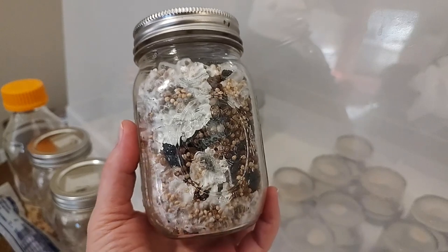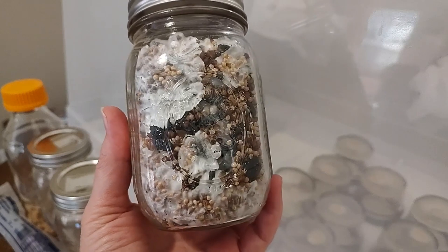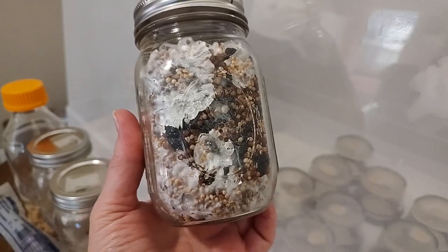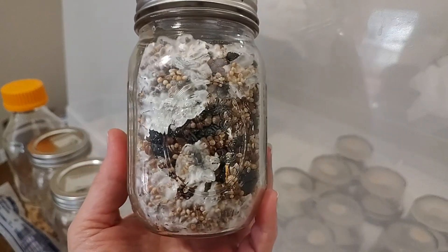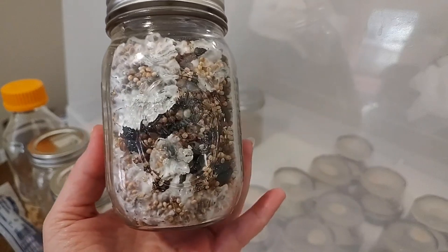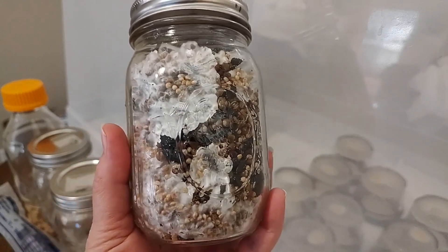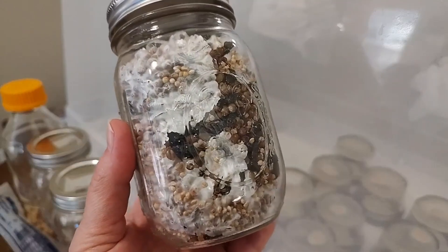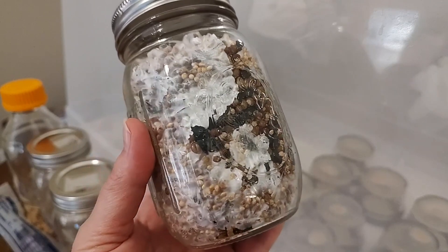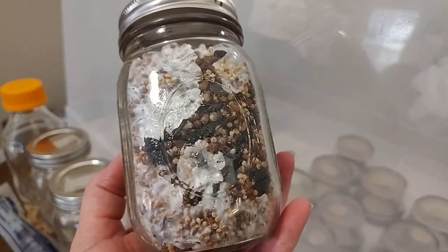Spores are inherently dirty — they just are. Even if you're getting the best spores, even if you're working with spore prints that you created, they are dirty. There is contamination, and that's okay. The point is you put the spores to agar, and we recommend that when you're working with spores you do a water agar. It's just purified water and agar, so there's no sugars or nutrients for contamination to feed on.